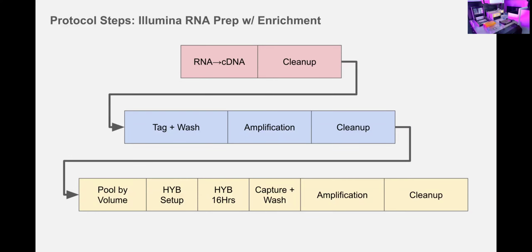Or if you're doing, let's say, Illumina's exome capture, I believe the suggested is pooled by 12. So you go from 96, the 12 columns, pooled down to a single column. So this adds the additional complexity of using the 96 channel head to handle these different sample throughputs at various stages throughout the protocol.